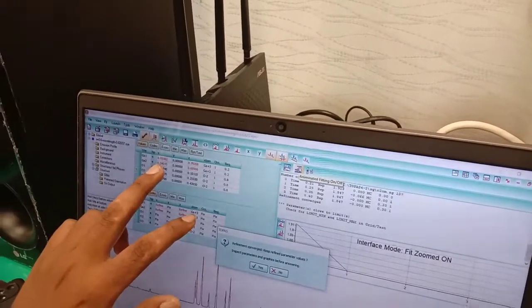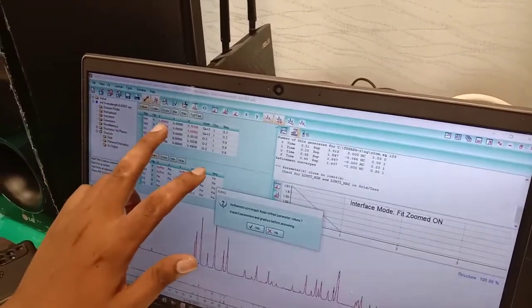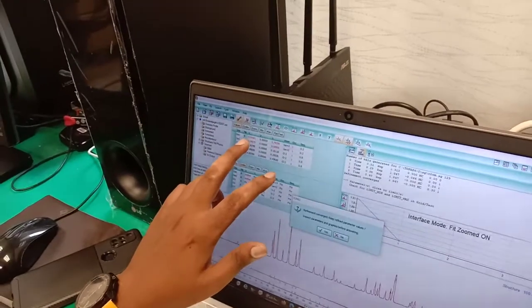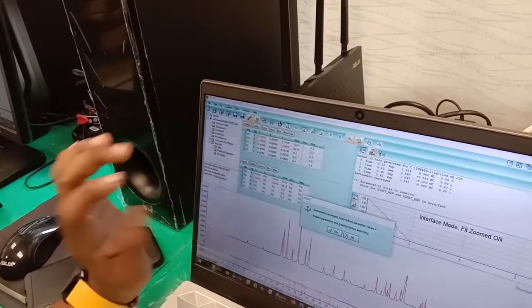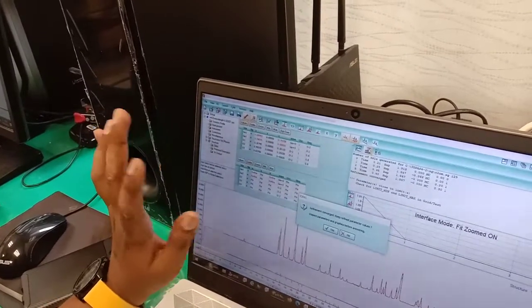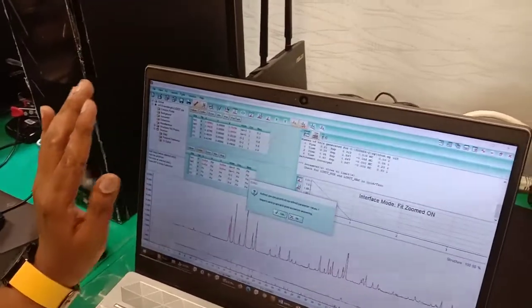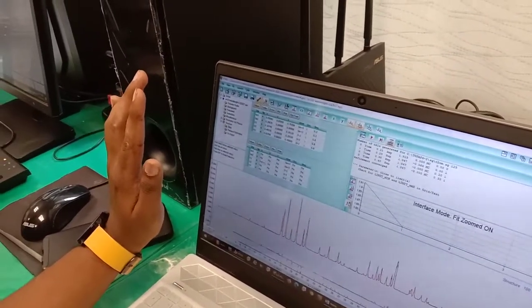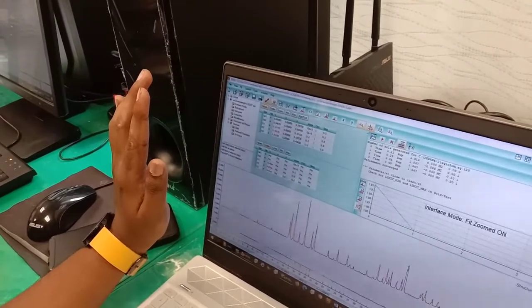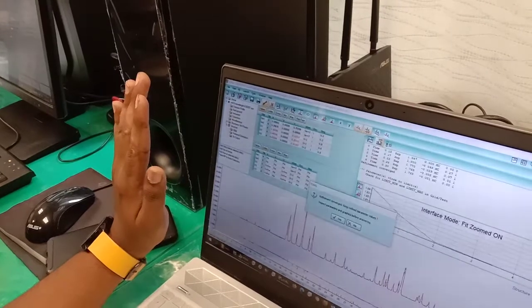So you're just refining one of those? Yeah, the position will be refined a little bit. Sometimes if this position suddenly turns into 0, or suddenly turns into 1, or 0.1 or 0.2, it means that the refinement is actually not right, which means that site has some particular issues. So I just say okay, then I choose the lighter atoms, O1, O2, O3. Okay, then I just refine it.